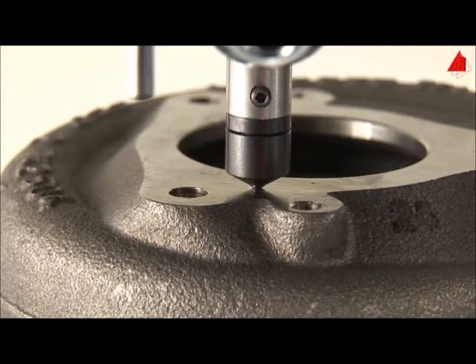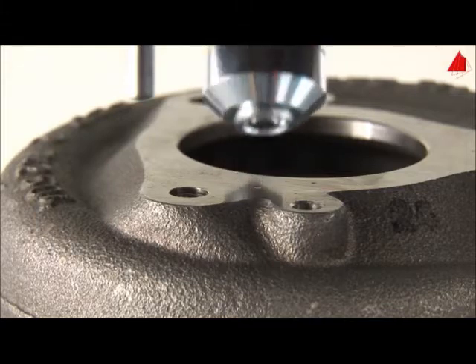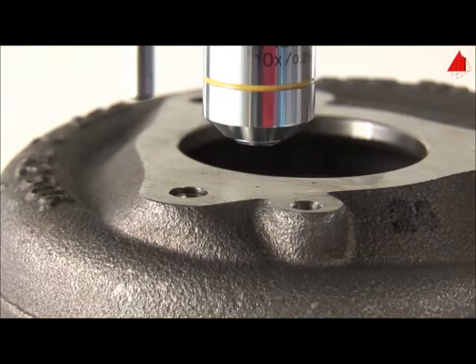Gradually and shock-free, the test force rises to its specified value. After maintaining the test force for a certain time, the indenter automatically lifts off again and the microscope lens pans back to its former position.